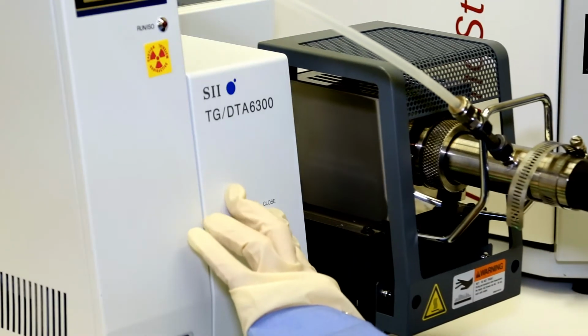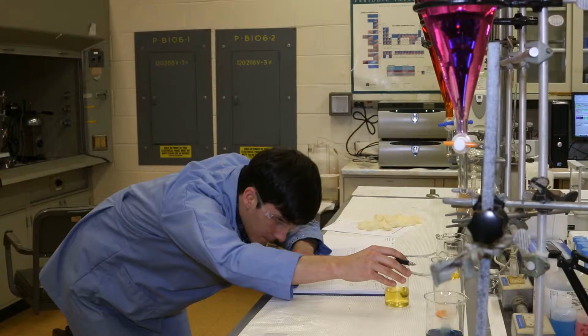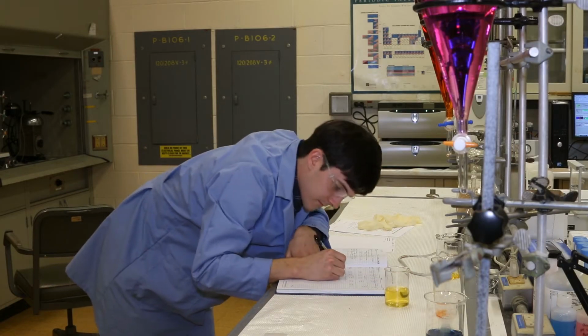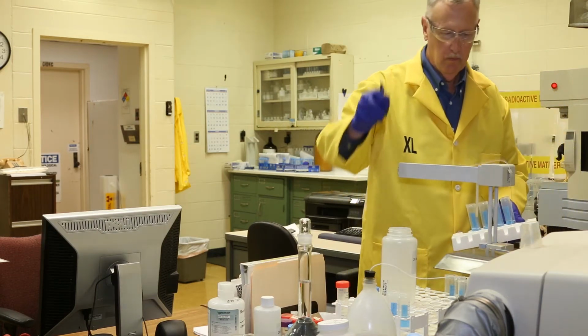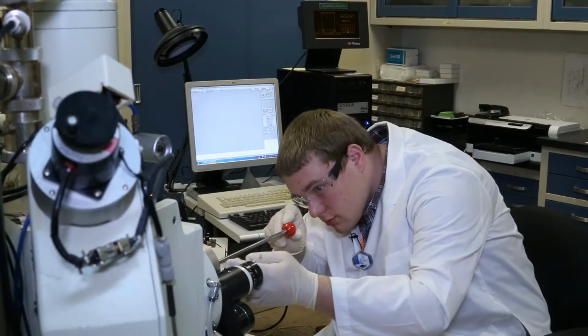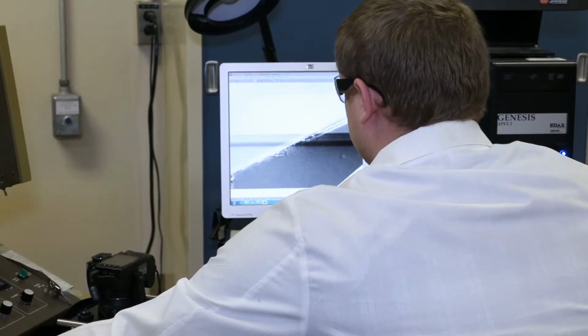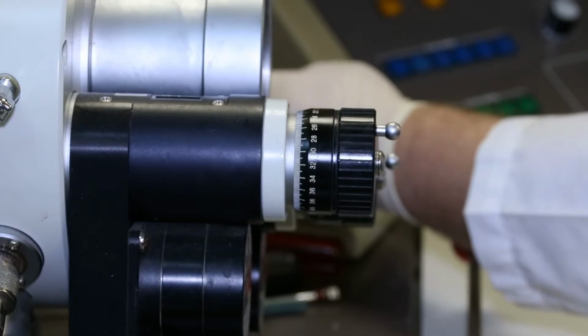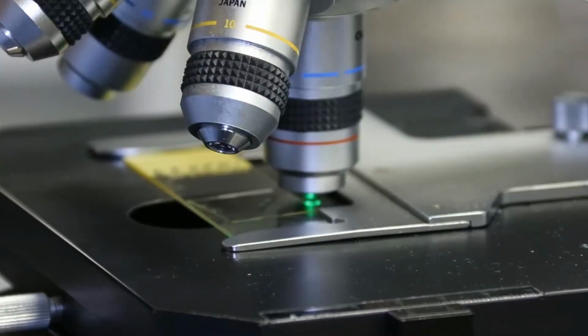As an investigative laboratory, most of our projects start with the definition of a problem, which means that this laboratory has to have a variety of investigative approaches so that once you get the first piece of evidence, you can move on to another piece of evidence and be able to either accept that as a cause of the problem or not. This, in fact, is what we mean by industrial forensics.